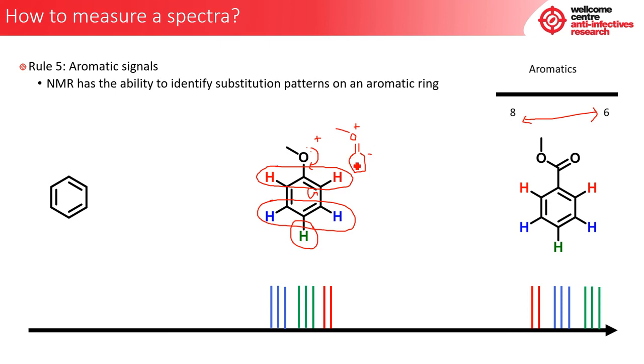In doing so, what we can say is that there are more electrons present in this position than there are that's now attached onto the oxygen. Through the resonance structure, if we start to keep drawing this, we will find that the negative charge can then move again and therefore be found on the 4 position on the ring. So what happens is that when you have this electron donating species, as you see here, the positions that are affected are position ortho and position para.